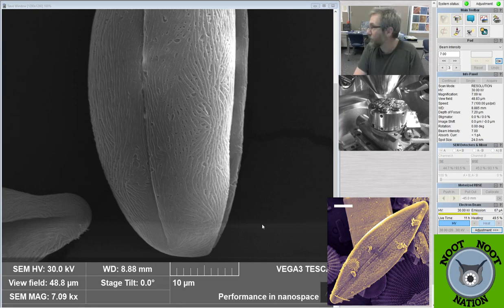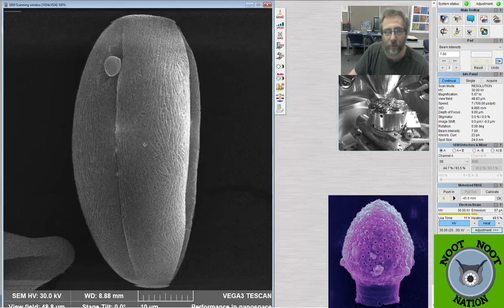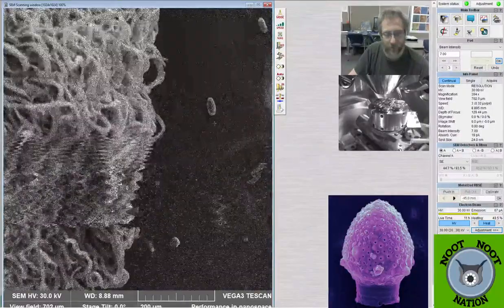This is either locust or oak. I'm going to just call it locust for now, or maybe I'll call it locust/oak pollen. I don't know. Maybe I'll be able to look it up later, or somebody out there wants to try to Google it and find out. I guess we could find out that way.